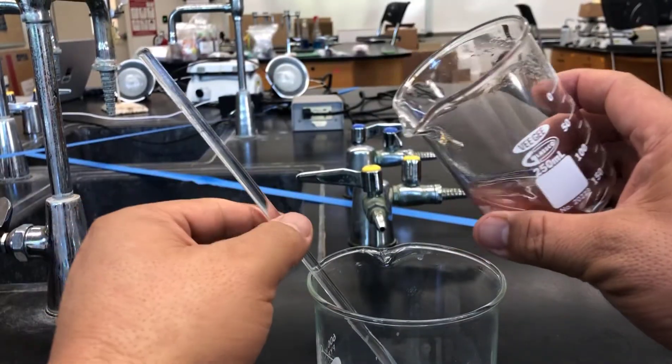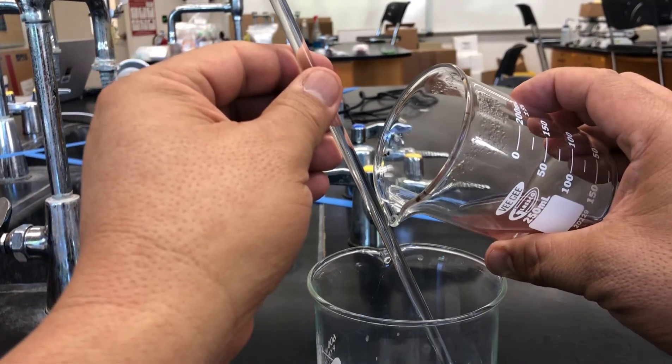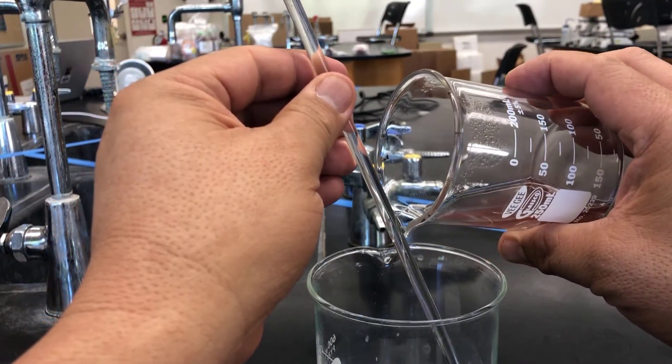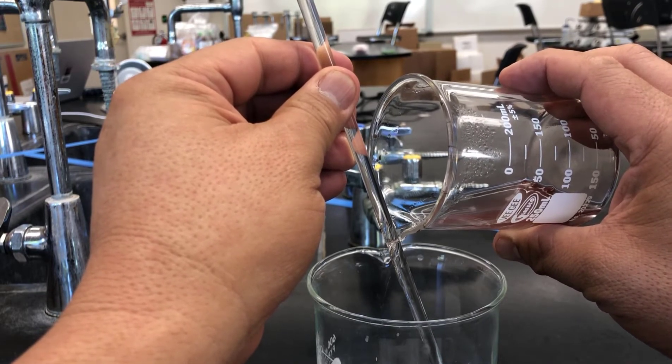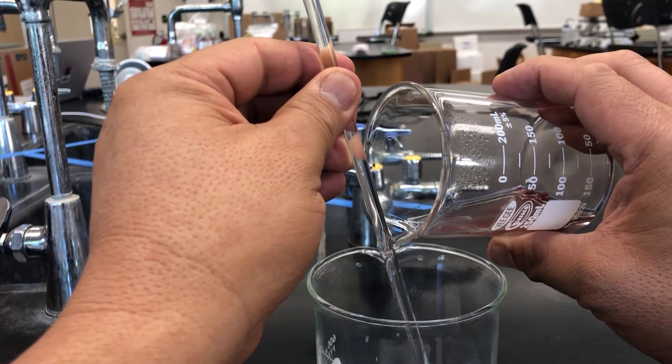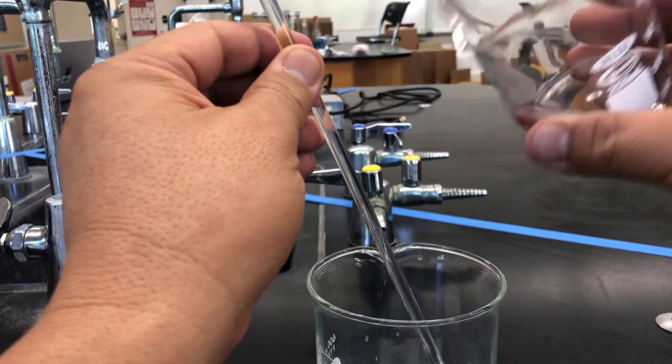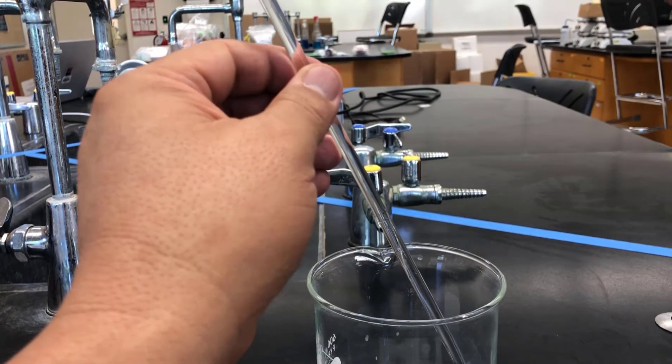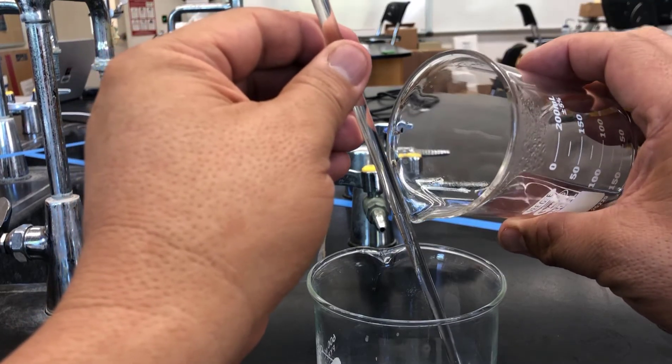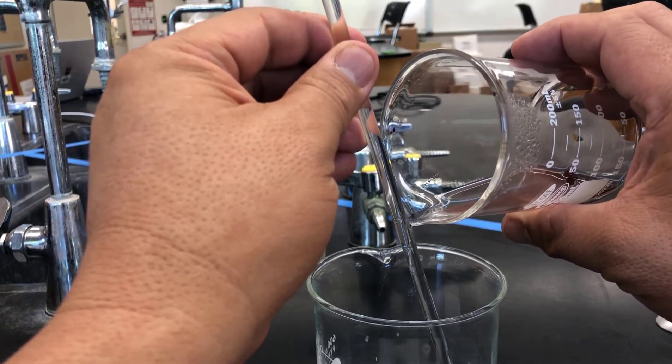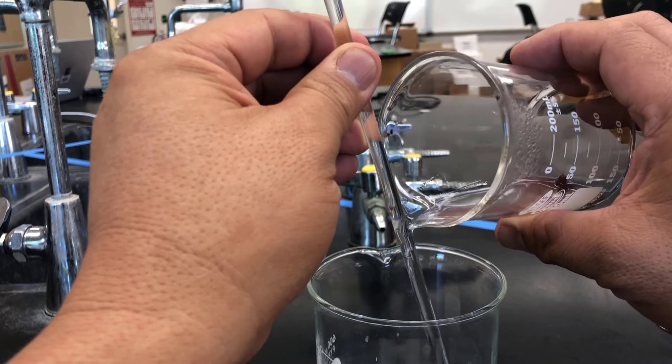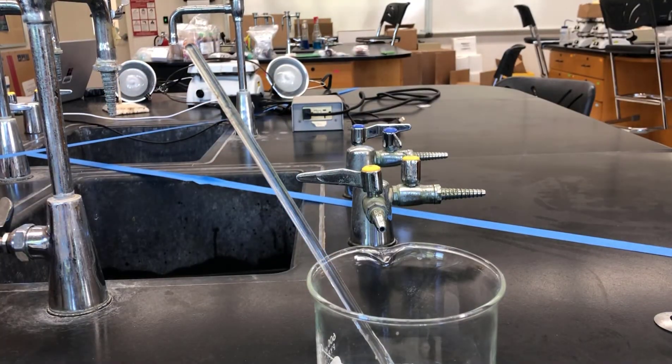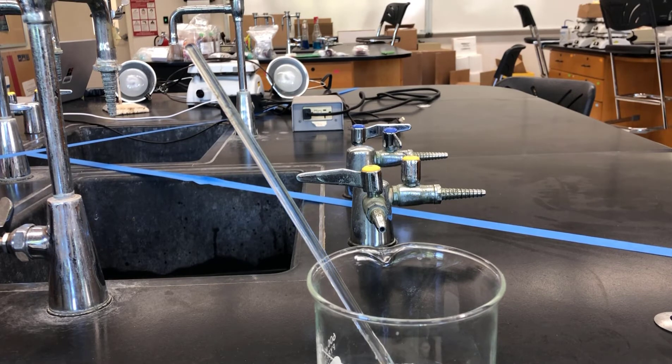There we are for this second decanting. It has finally settled pretty well. I'll try to get as much of the water out as I can without losing much copper. It's basically impossible not to lose a little copper. I'll let it settle again before I do the rest.